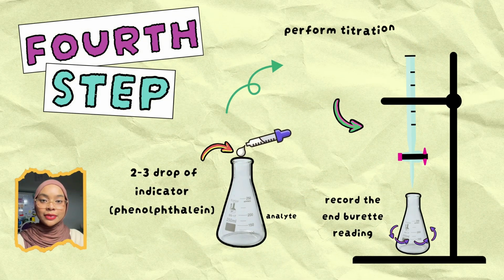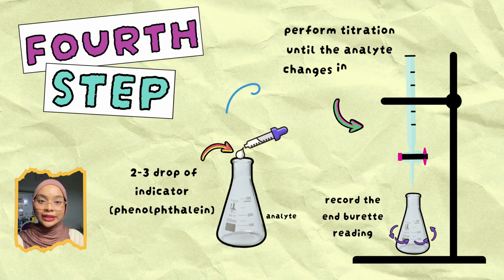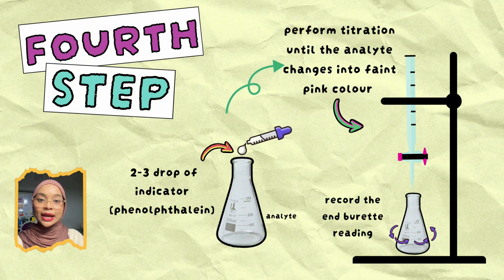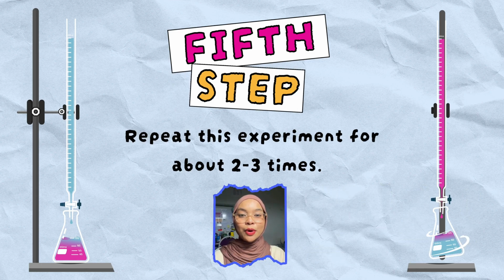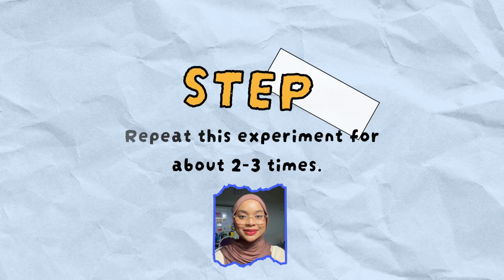For the fourth step, add 2 or 3 drops of indicator like phenolphthalein into the analyte. The solution should remain colorless because the analyte is acidic as it's not reacting to hydrochloric acid yet. After that, perform the titration and record the endpoint. The endpoint is when the analyte changes into faint pink color. Lastly, repeat this experiment for about 2 to 3 times.